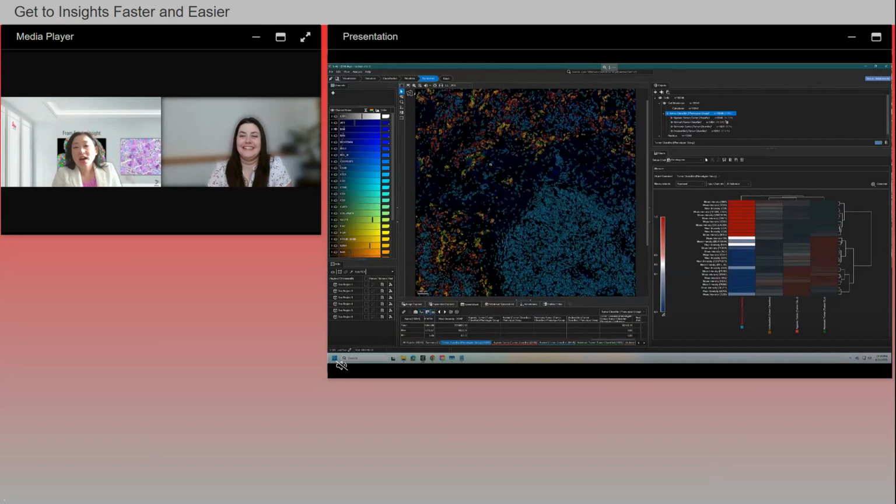Yes, I see that. Not only based on nuclei, but maybe nuclei or cytoskeleton. Yes. So currently, we have a number of recipes to make this happen. Specifically for 2D and 3D, we have a number of different recipes enabling users to take in multiple channel inputs, for example, to detect nuclear cytoplasm in our multiplex detection recipes. We encourage you to send us your data and we can work with you to see what is possible. I would need to see the actual data to see whether we can handle them currently or not.